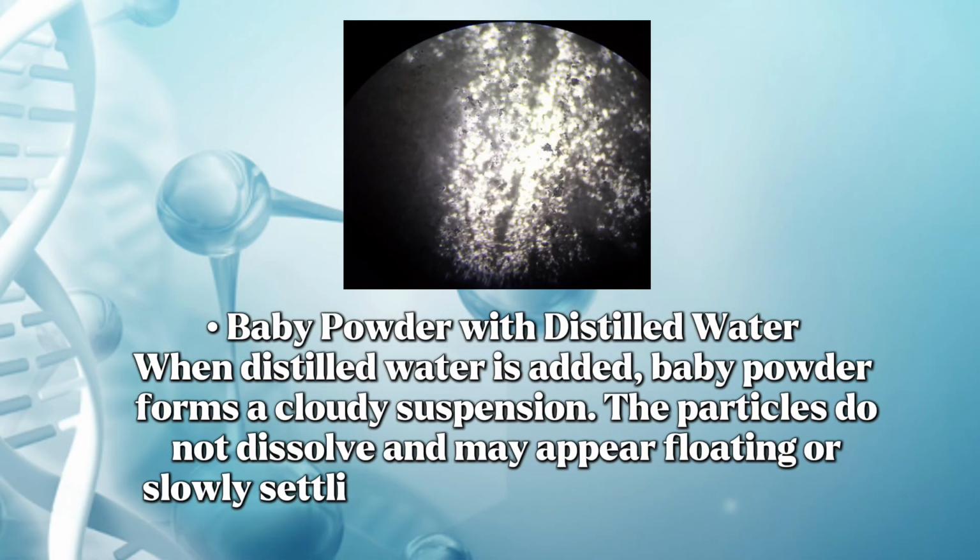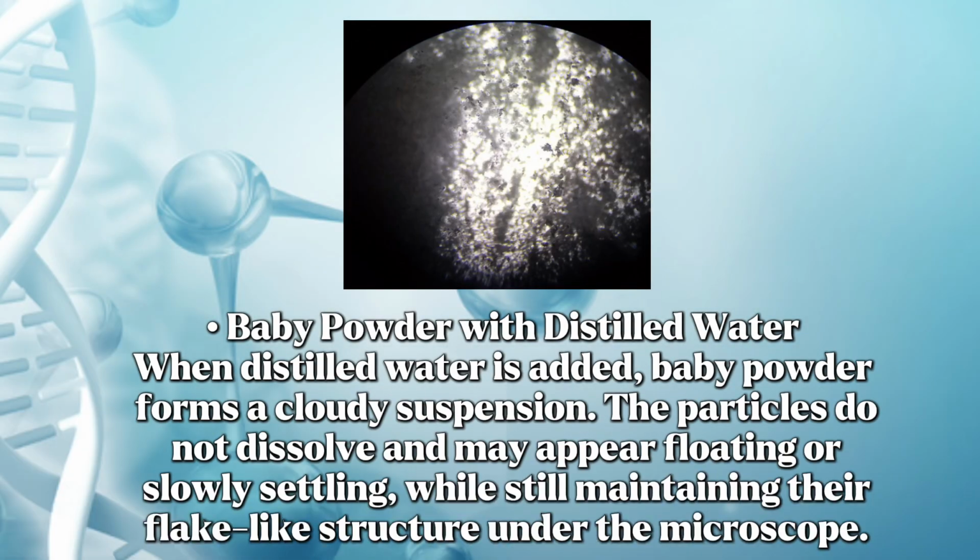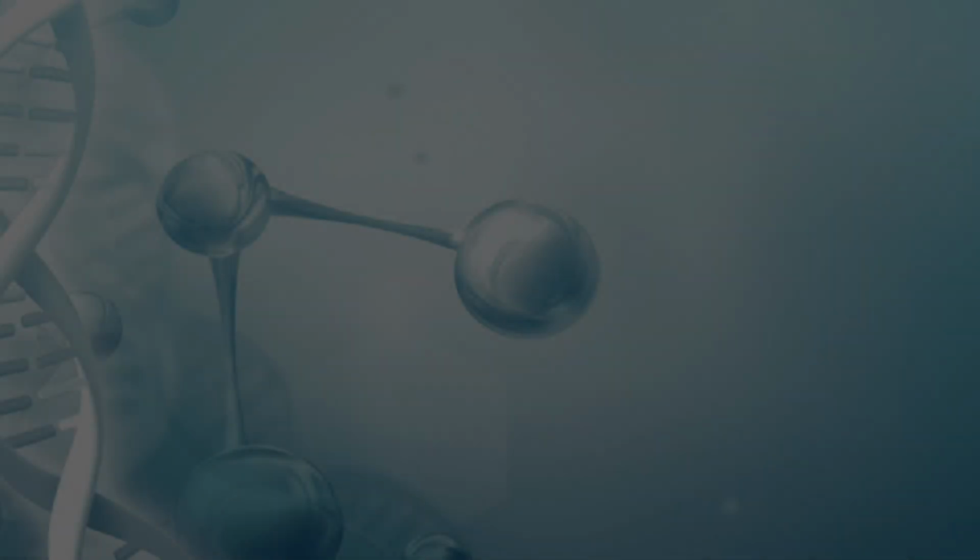Baby powder with distilled water. When distilled water is added, the baby powder forms a cloudy suspension. The particles do not dissolve and may appear floating or slowly settling while still maintaining their flake-like structure under the microscope.